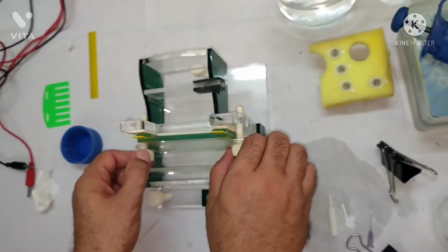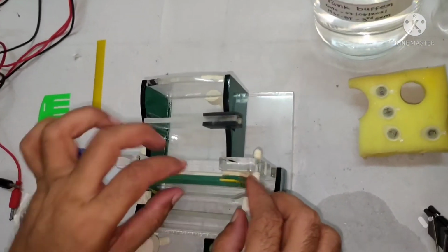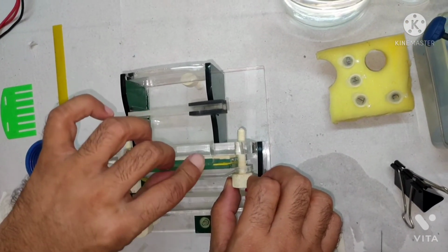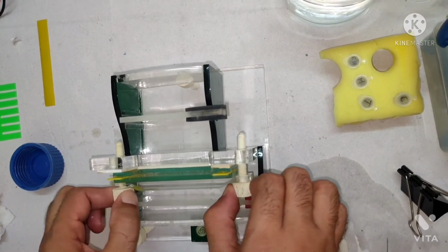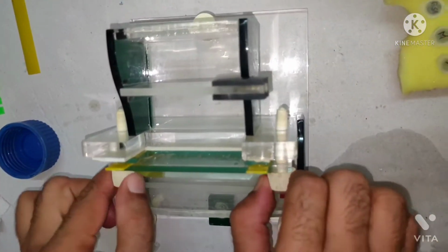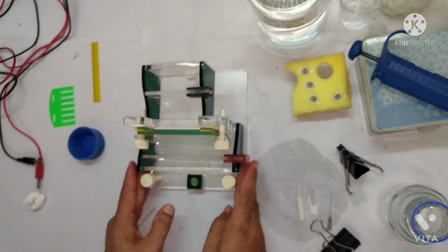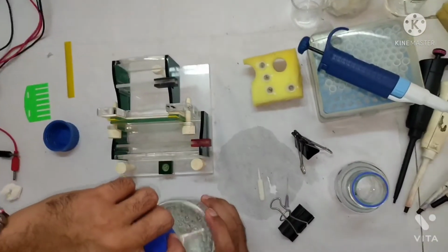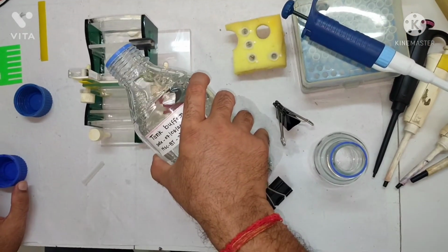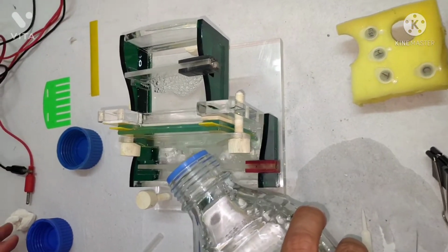So now this is just a little bit, so that it will make the circuit, current circuit should complete. Tighten it properly, otherwise your buffer will leak, right? Okay, and now we have tank buffer, right? Now electrodes are here. Now you add your tank buffer, and this is our tank buffer. So I put my tank buffer here in the upper tank, and this is in the lower tank, right?